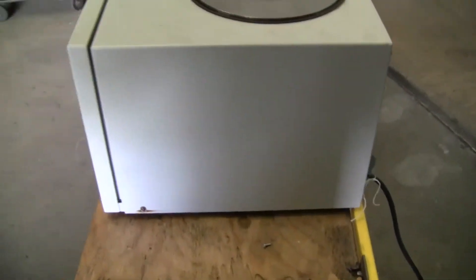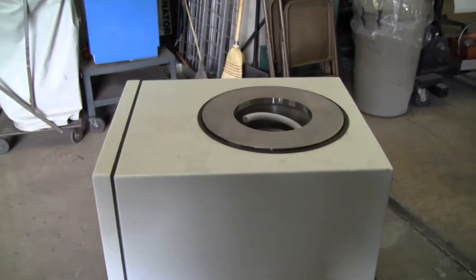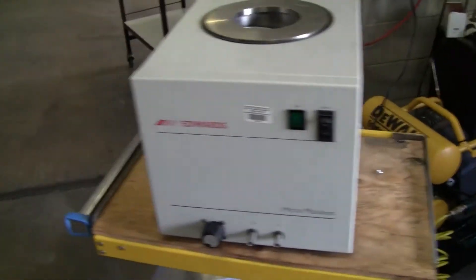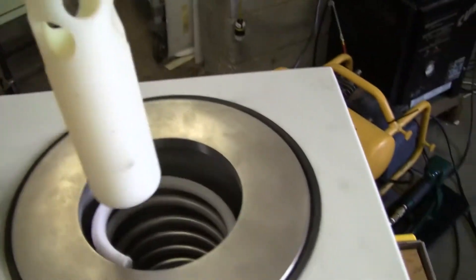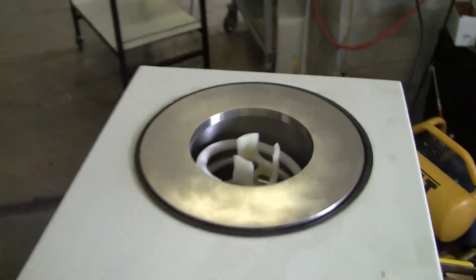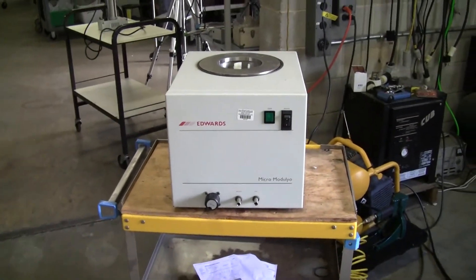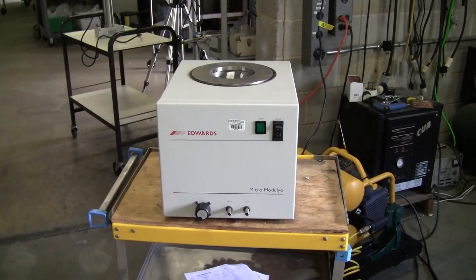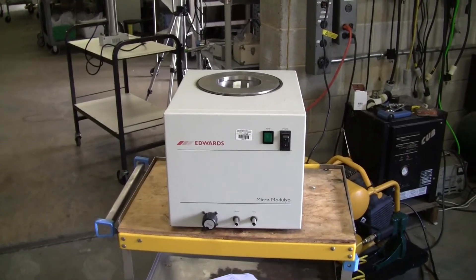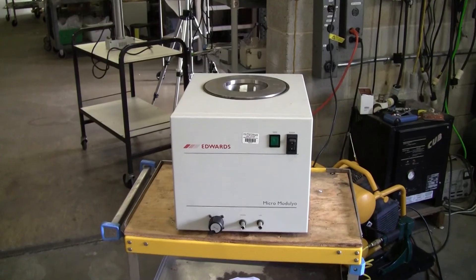Taking a look at this other side — you are getting what you see here in the video. You have this unit, it has the coil inside, and this holder also comes with it. If you have any further questions about this unit, please don't hesitate to call us at area code 609-518-9100. Thank you again from Hitechtrader.com.